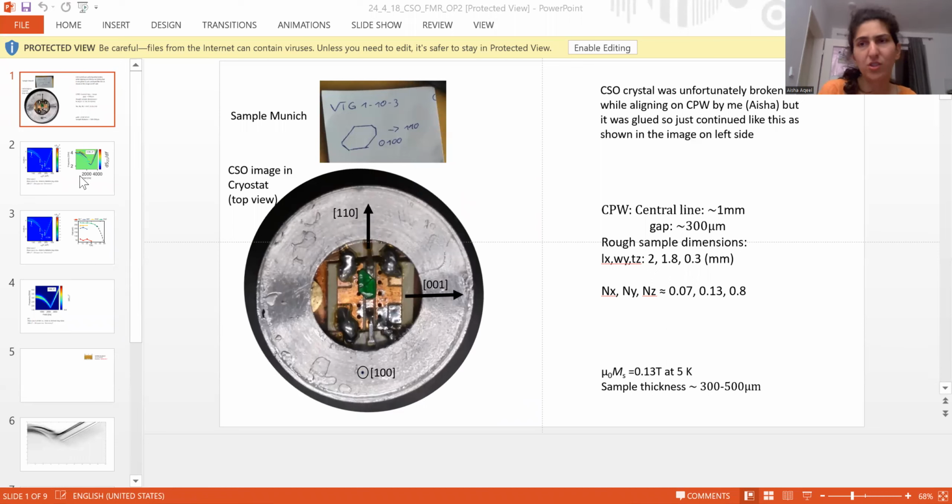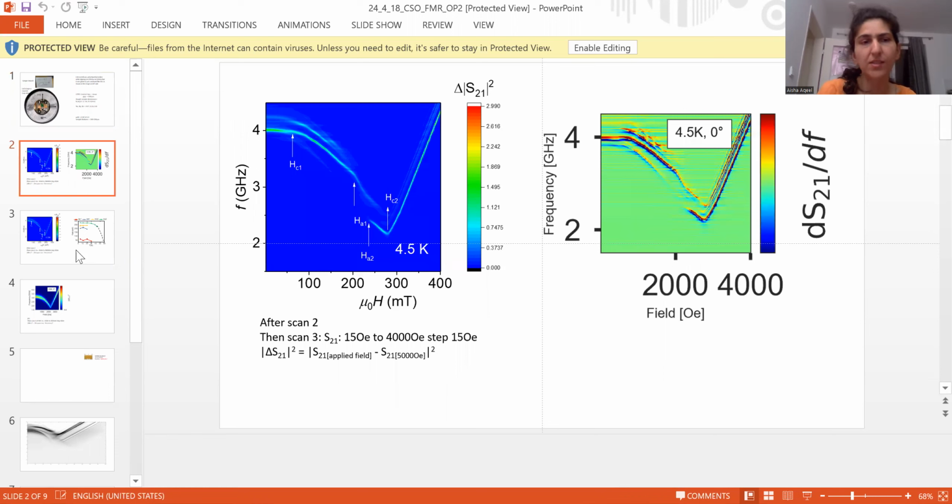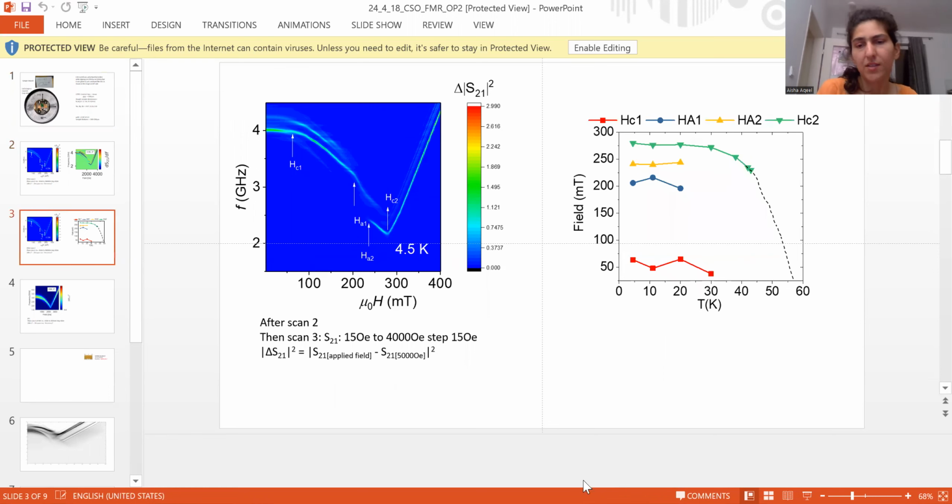At the start, I usually just put pictures, not randomly, but I do not focus on organizing them so much. I put in important results and gather them. And then with time, this PowerPoint will become more and more detailed and better, more organized. It will become like a story.